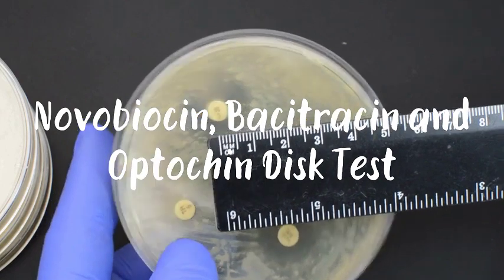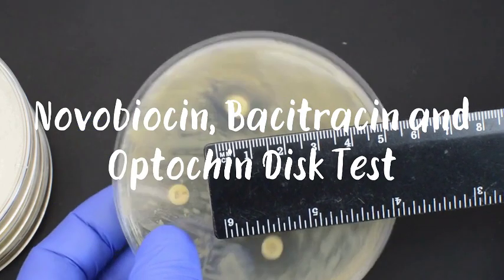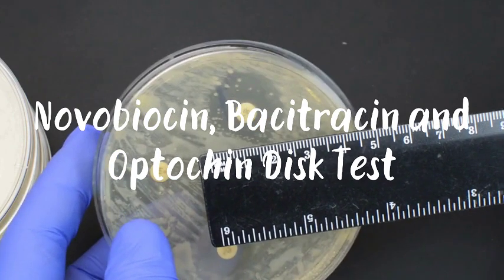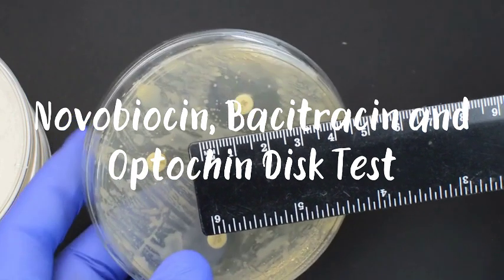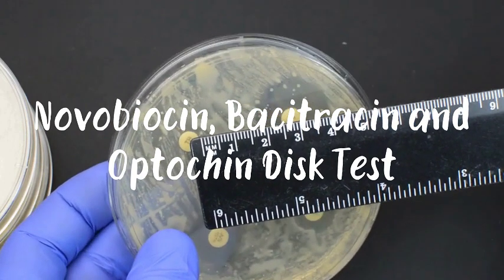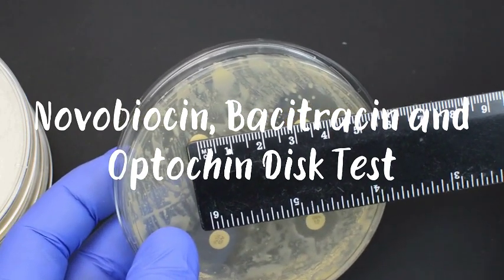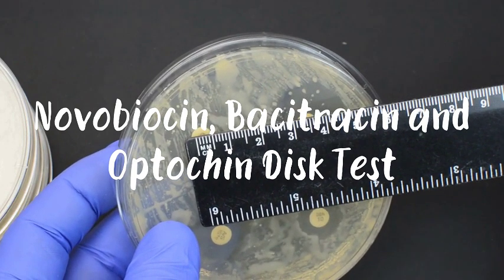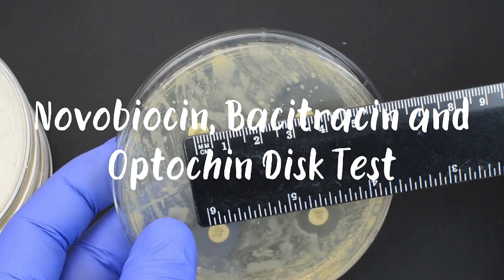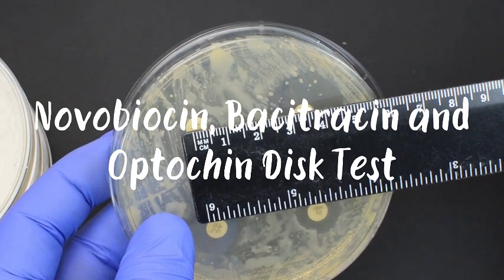For the bacitracin test, we are going to detect Streptococcus species. If the organism shows an inhibition of growth, then we can identify that the Streptococcus organism is Streptococcus pyogenes.